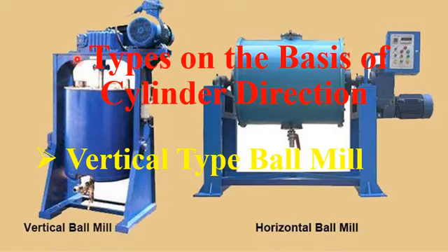So noise inside the ball mill is very low, and the energy, which is usually in the form of electricity, is consumed less as compared to the horizontal cylindrical ball mill. As experimentally proven, this type of vertical ball mill apparatus is a key part of the materials industry because of its efficiency and its lower noise as compared to the horizontal type ball mill machine.